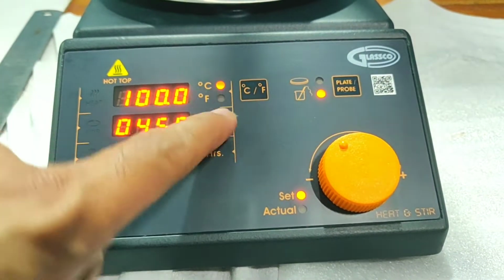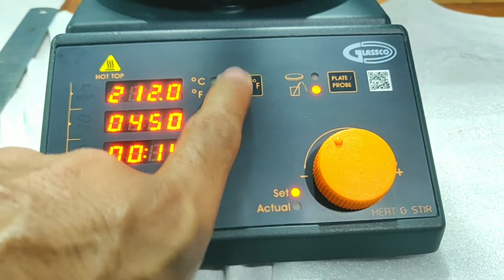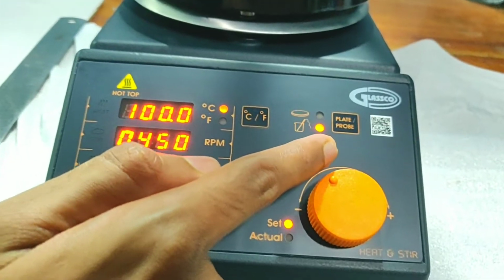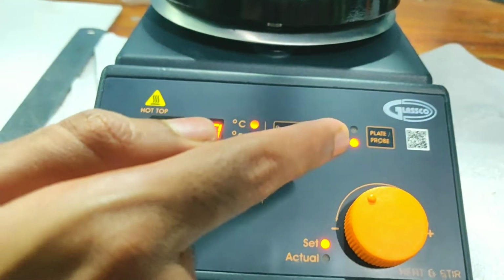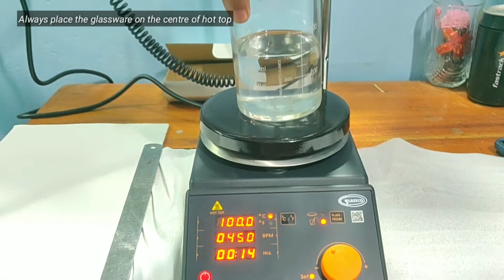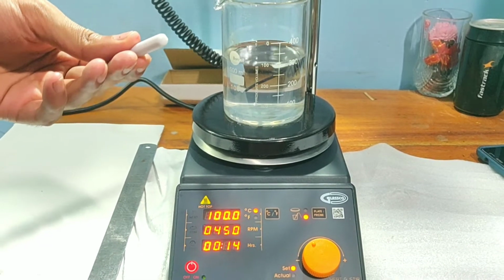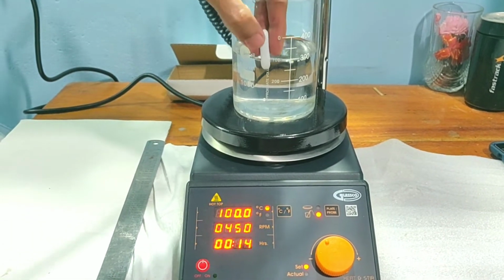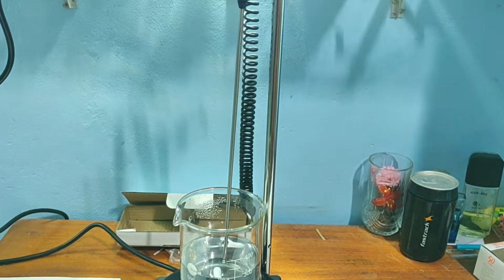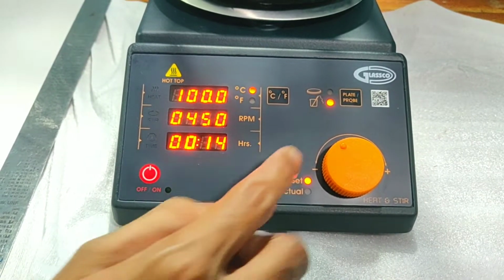Temperature can be either set in degrees Celsius or degrees Fahrenheit, which can be changed by pressing the switch here. Here 100 degrees Celsius and 212 degrees Fahrenheit is the equivalent. On the right we have another switch which will show the temperature of the hot plate and the probe. So to start, I place a 500 milliliter beaker with 300 milliliters of water in it. Then I drop the stirring bar into the beaker. And now we got to adjust the temperature probe into the beaker so that the probe measures the exact temperature of the container.